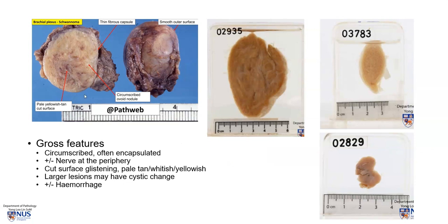Grossly, these tumors are usually circumscribed, and in fact they are often encapsulated. Sometimes you may actually see the nerve of origin somewhere at the periphery of the tumor. The cut surface is usually glistening and has a pale, tan, whitish, or sometimes yellowish appearance, as we can see here.